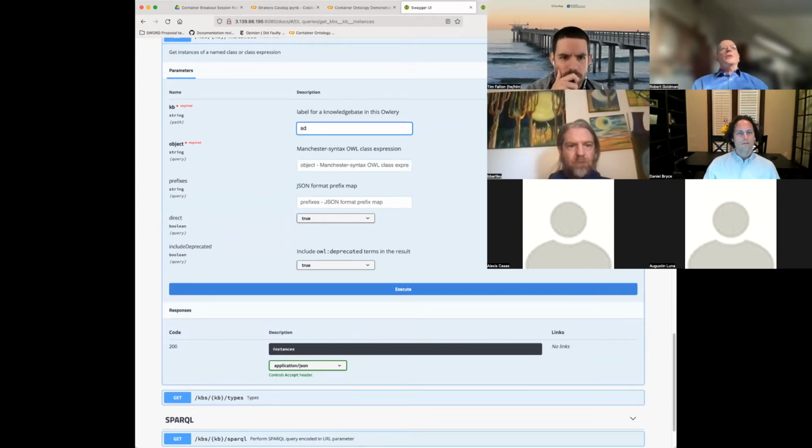So this is the one, tell me about all the instances of some class. So I can say, give me all the plates.